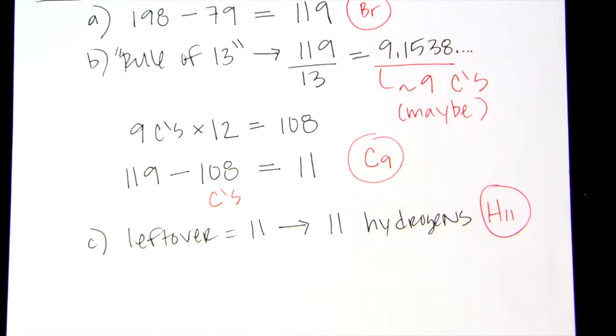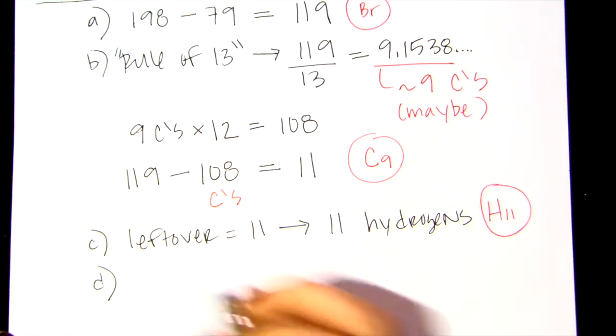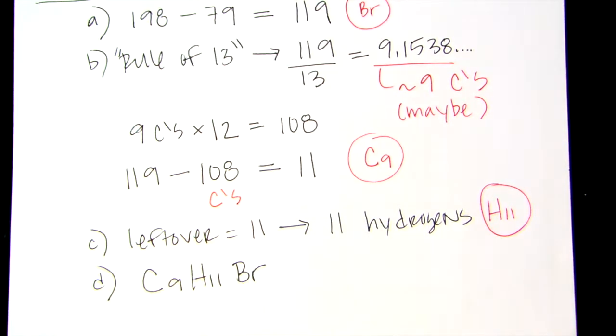Because if you get a formula that's like C2H75, that can't be, okay? So that means you usually have that extra mass might be oxygens and things. So you have to make sure it makes sense. And so usually a way to assess if it makes sense is you just put it together and maybe do a DOU calculation and see if it gives you a reasonable number, right? Because if it doesn't make sense, you'll get a negative number or something crazy like 40 or something that doesn't make sense.